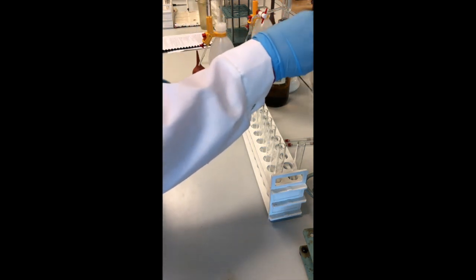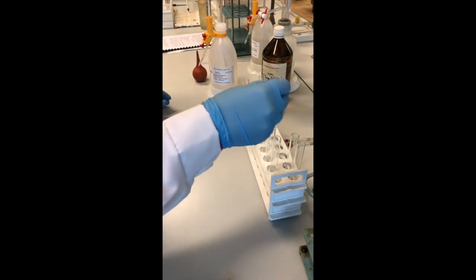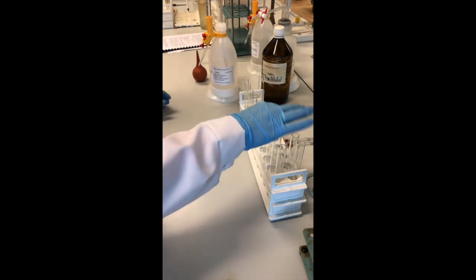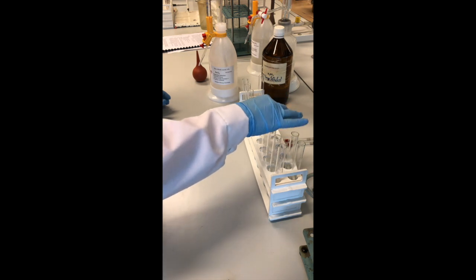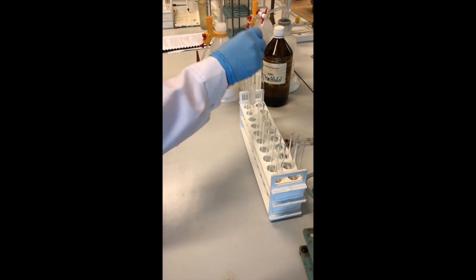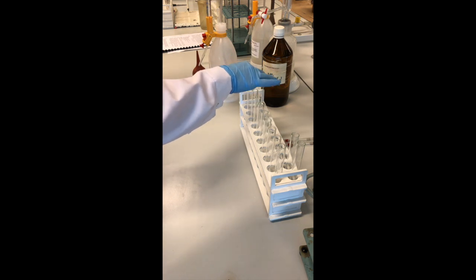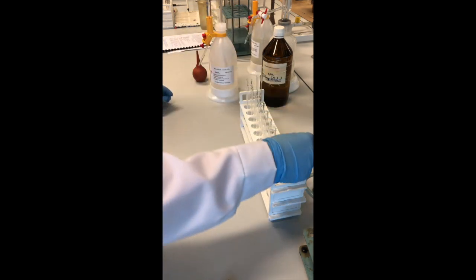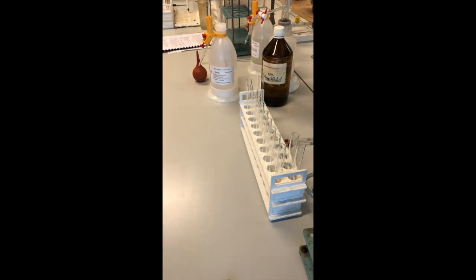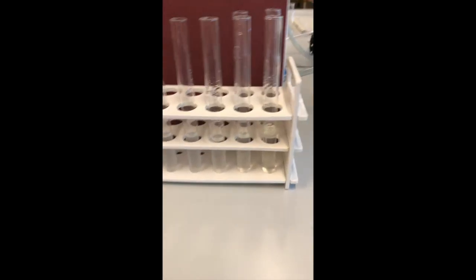Okay, so we can mix all of the samples. Wait 15 minutes.